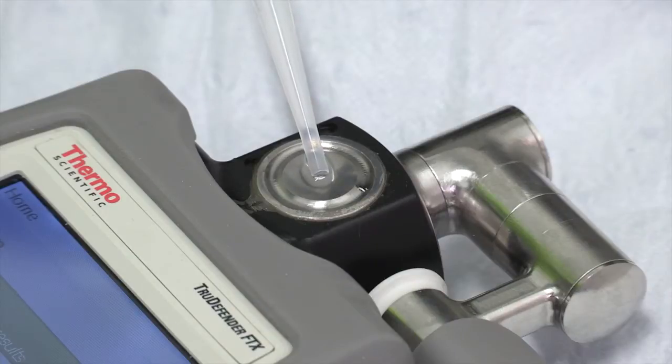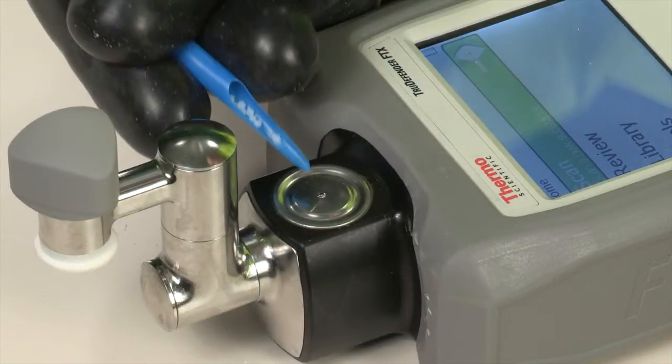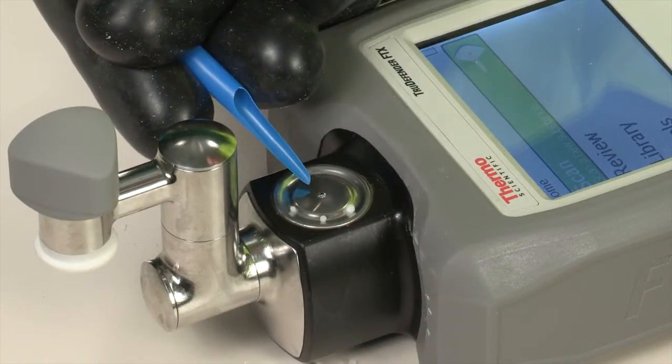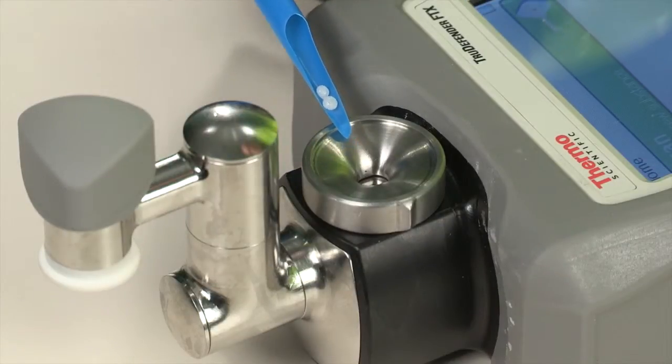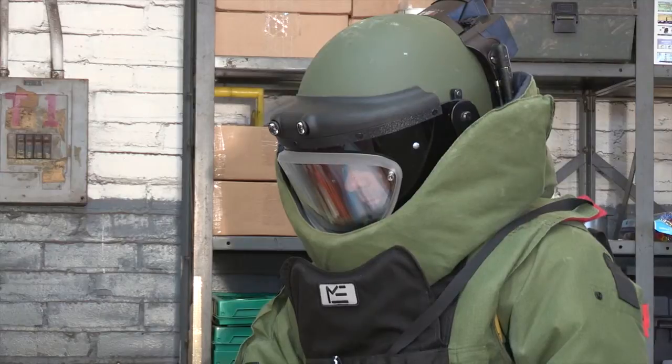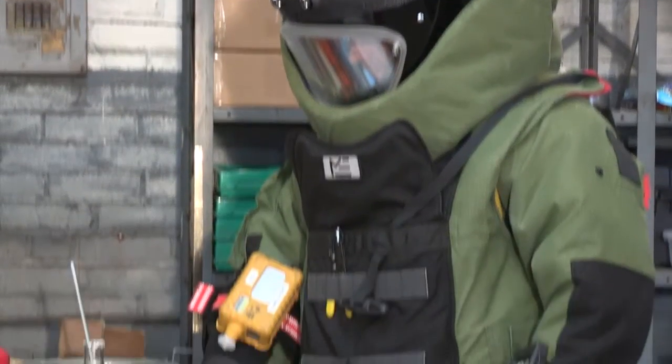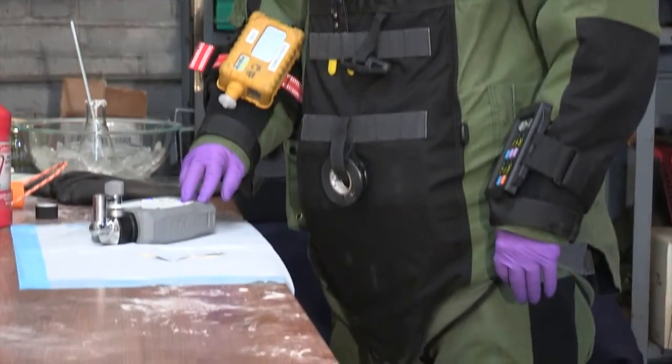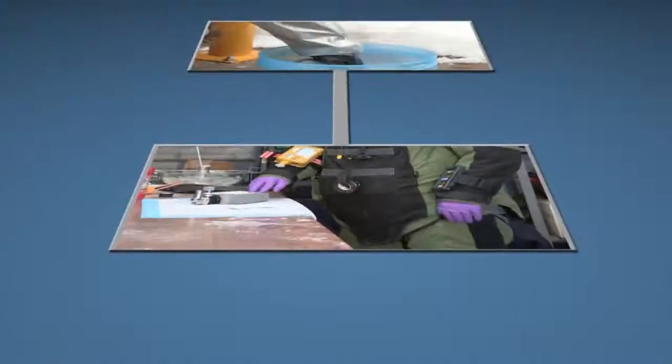Prills, notoriously difficult samples, are easily managed using the reversible sampling accessory. Technicians have clear visibility of the sample surface and can operate the instrument when faced with limited dexterity and visibility.